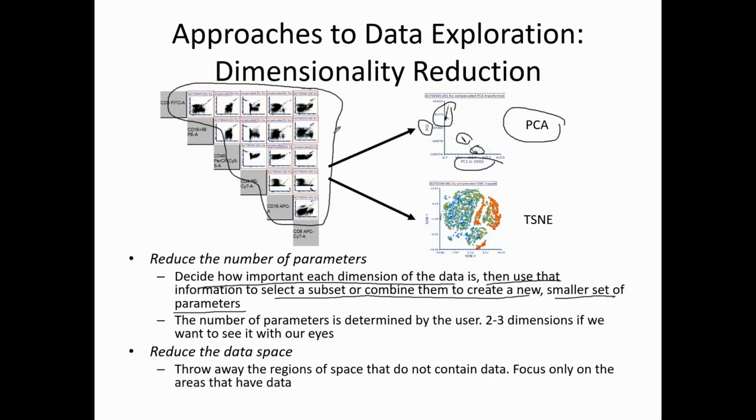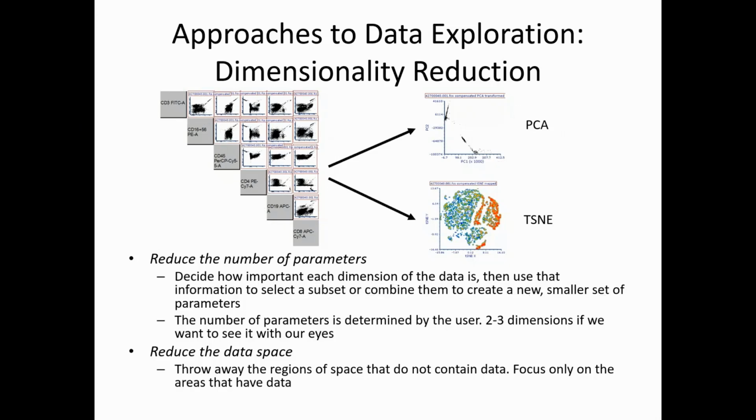Okay, so that's what PCA tries to do, is create a smaller number of parameters. And somehow these new parameters are combinations of the existing parameters.